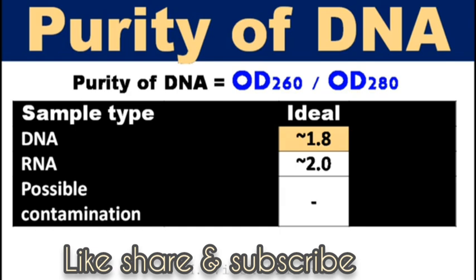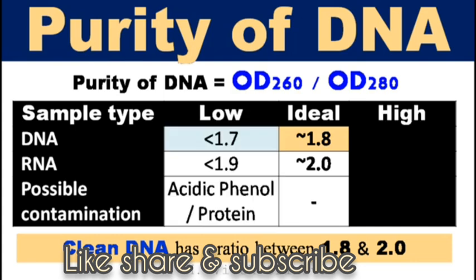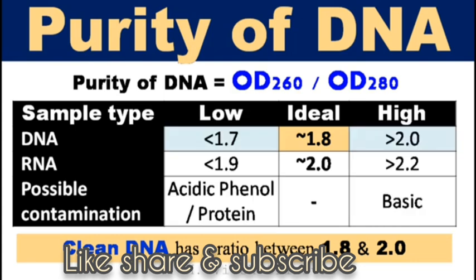If the ratio is between 1.8 to 2, then it is accepted as pure or clean DNA. If the ratio is less than 1.8, or more than 2, then it indicates the presence of protein contamination, or phenol contamination, or other contaminants. In that case, phase separation using phenol-chloroform step, or washing step can be repeated with the sample.